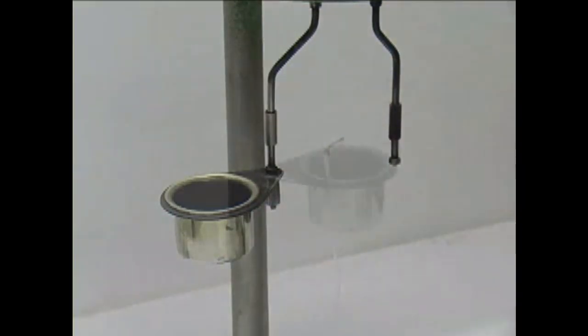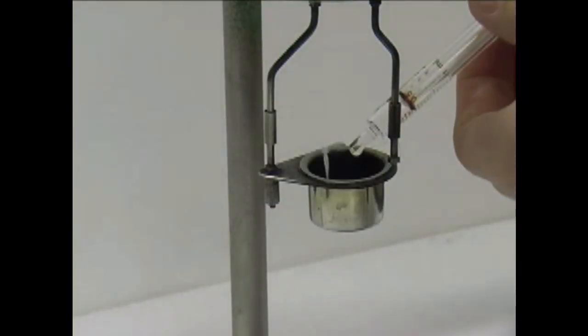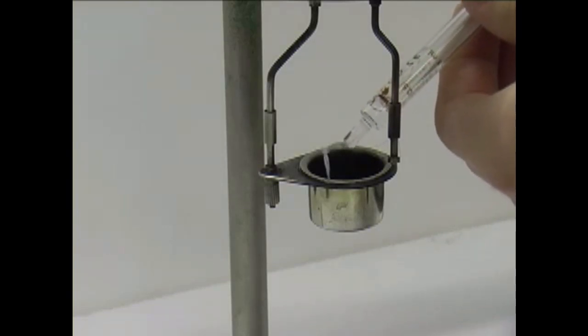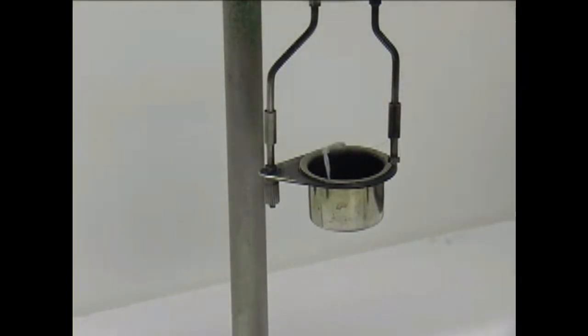When run, a high current is passed through the sidearms. This will cause the fuse wire to burn through, igniting the cotton, and the cotton leading into the crucible will ignite the sample.